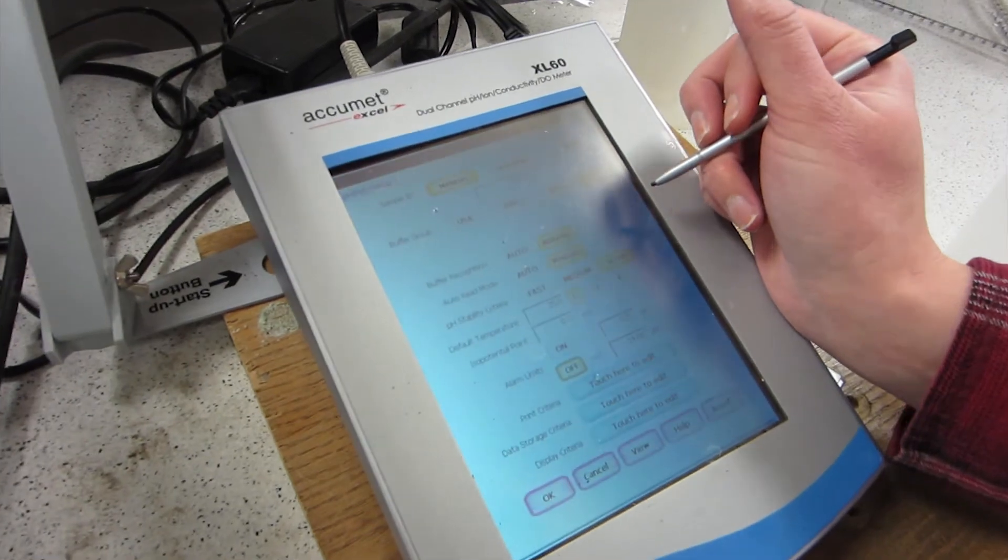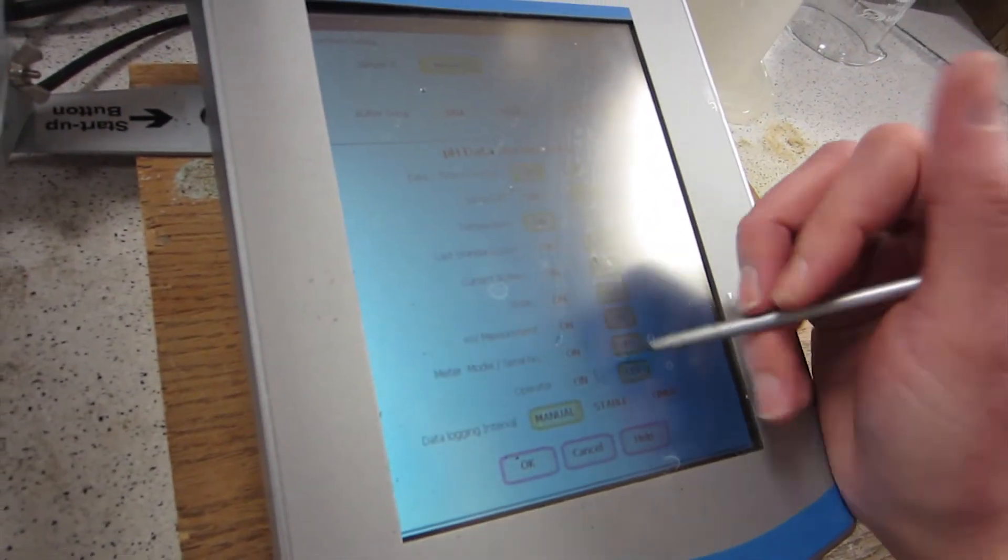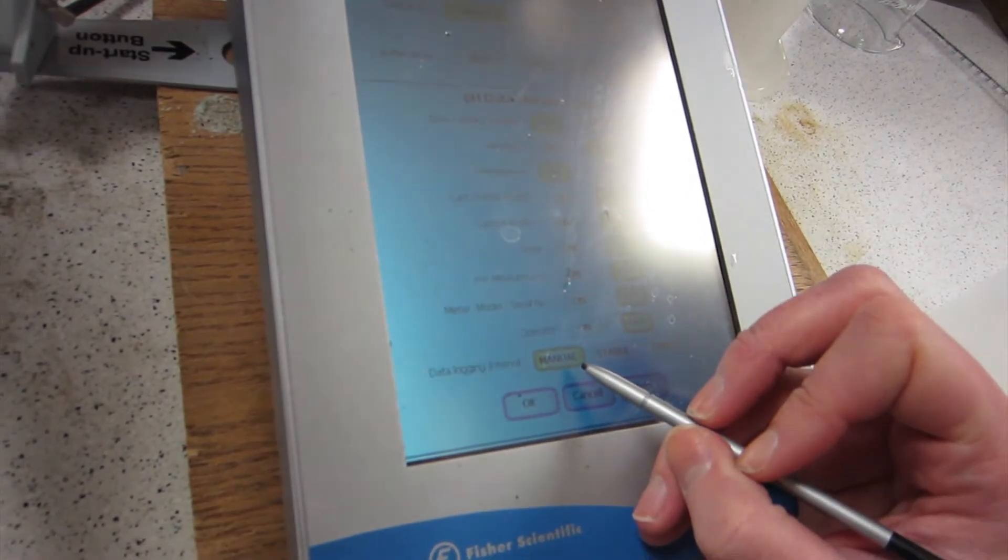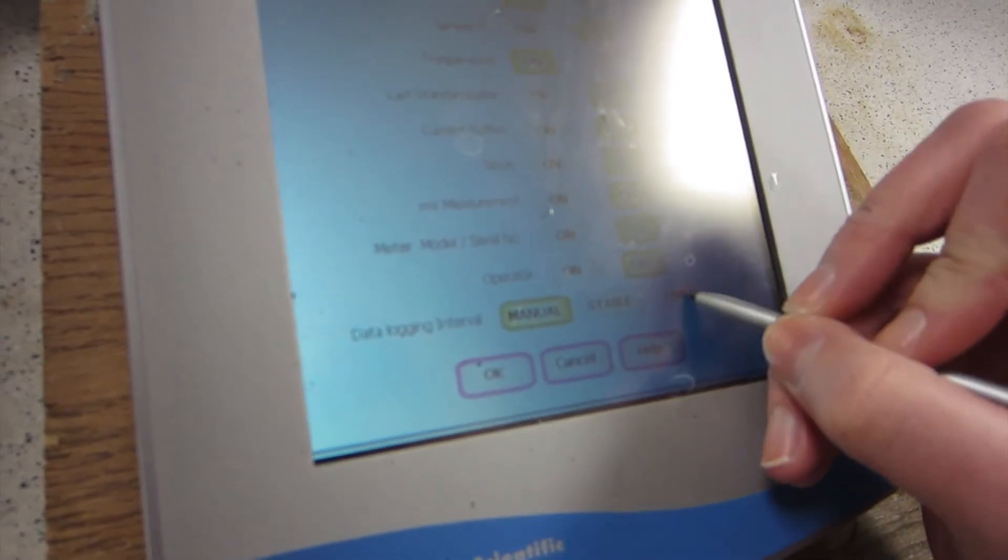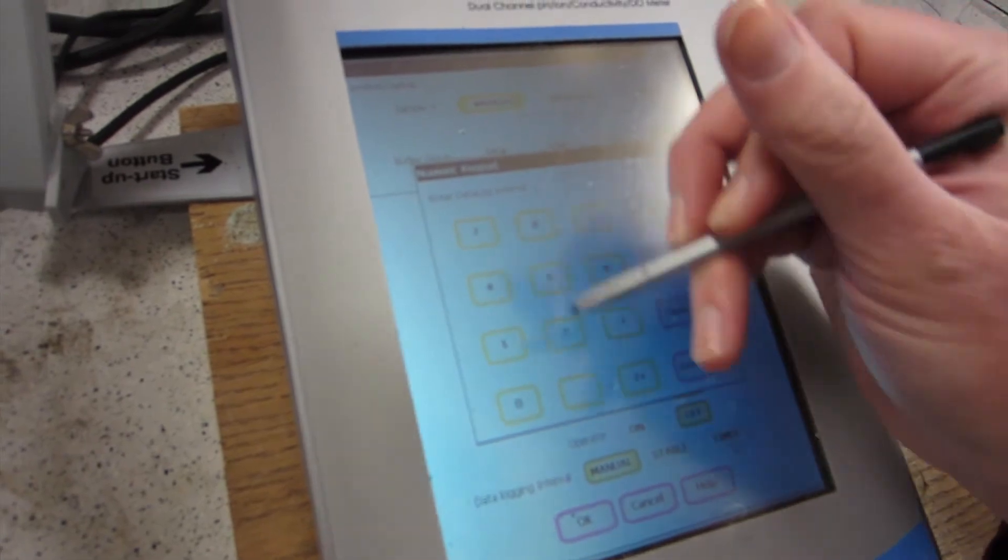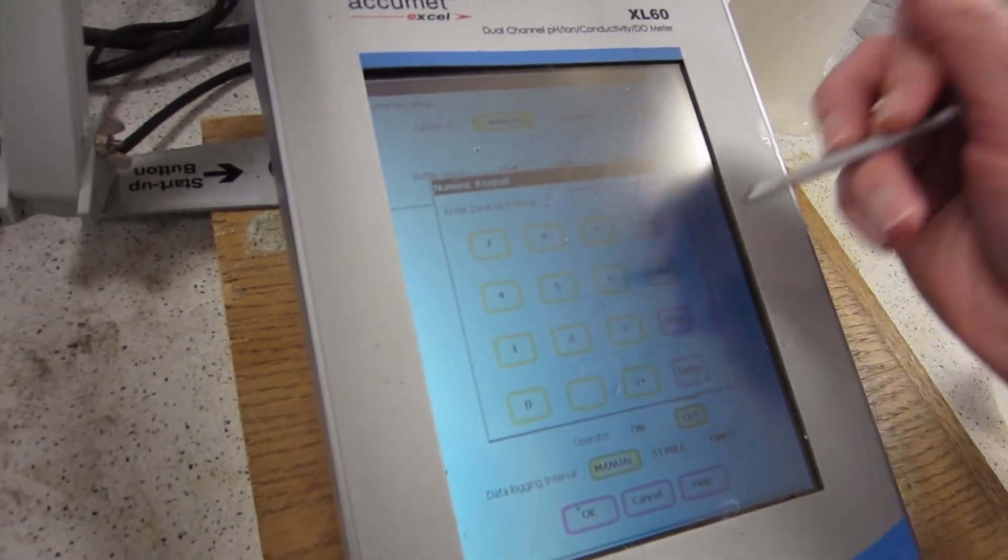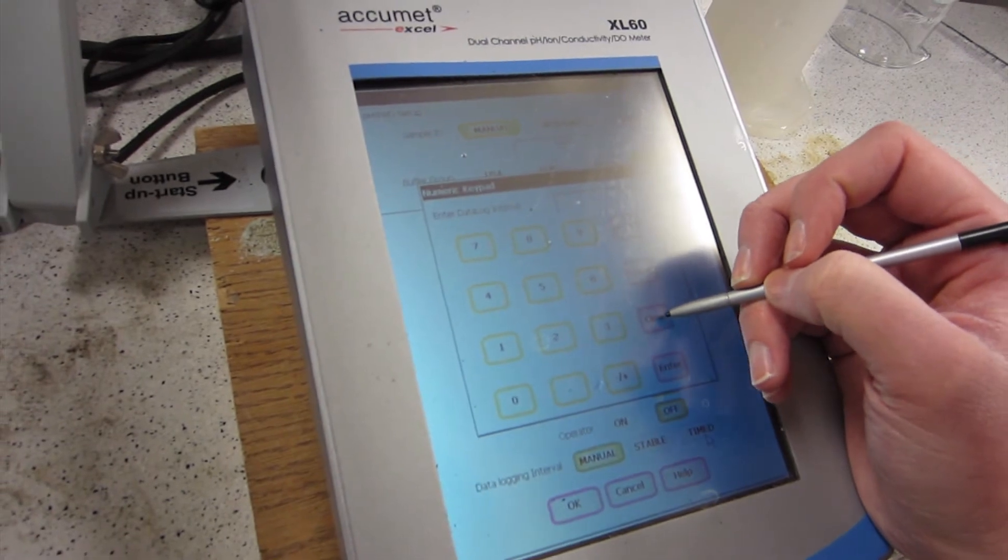Another thing you want to make sure of is that it's set to take data at a certain timed interval. Right now it's set to manual, which means you have to hit every time that you want it to take data. You're going to want to go to timed. The fastest that it can take is three seconds. You can choose the amount of time that you want it to take, and it'll take data every three seconds. Make sure that it's set to that before you start running.